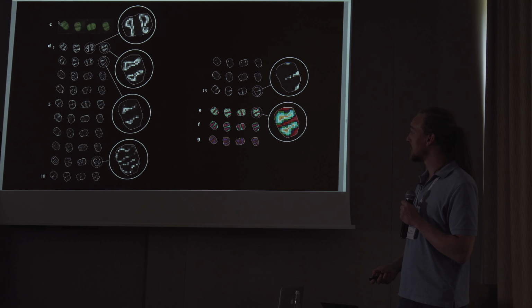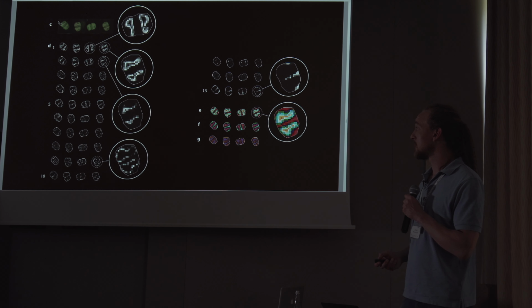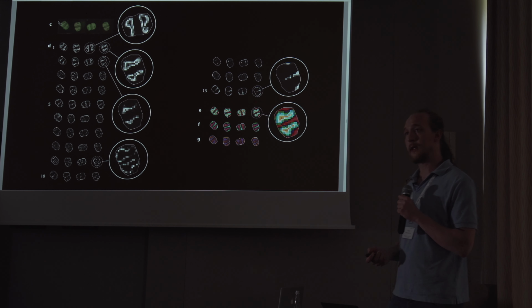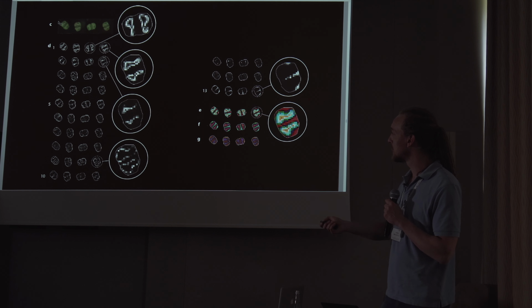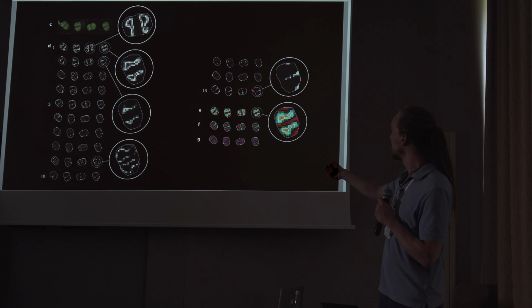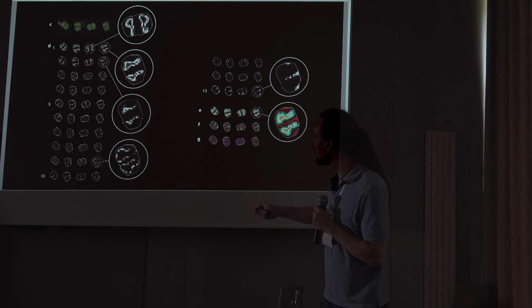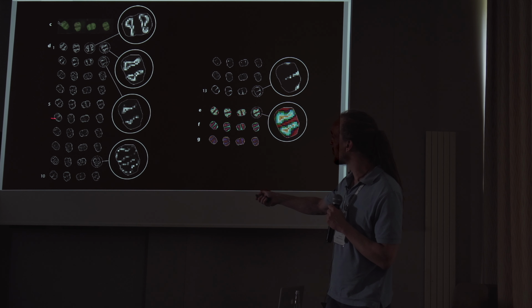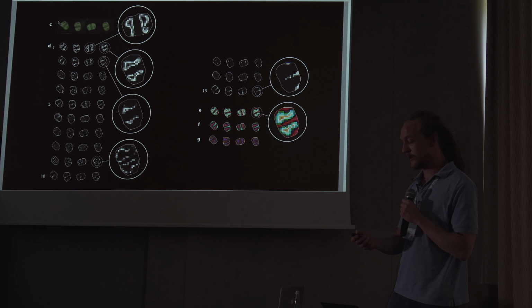Furthermore, we pick up numerous samples that stack, that have an inside-outside relationship. And there's relatively few factors that we need to capture the residual noise. You might, for example, notice that here number 12 doesn't have so much structure in it. And perhaps number 6 here is not completely consistent across the samples, but overall this is pretty good, I think.